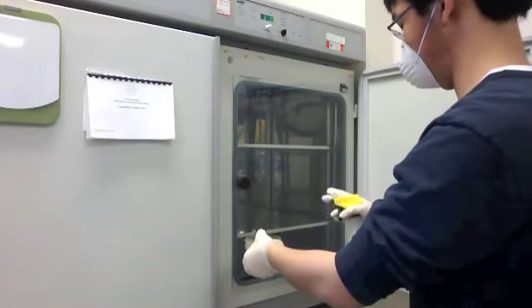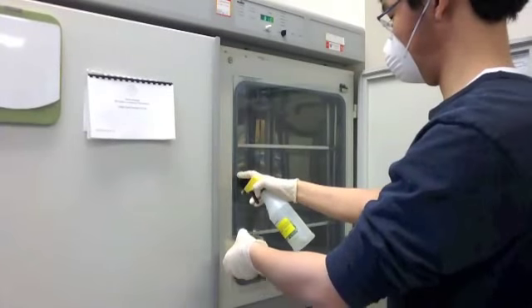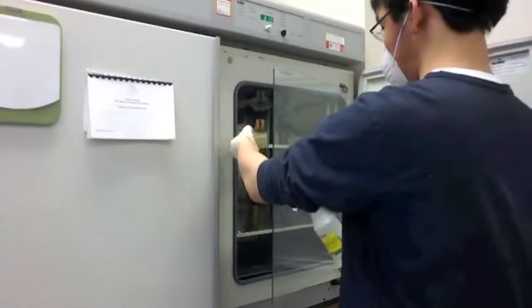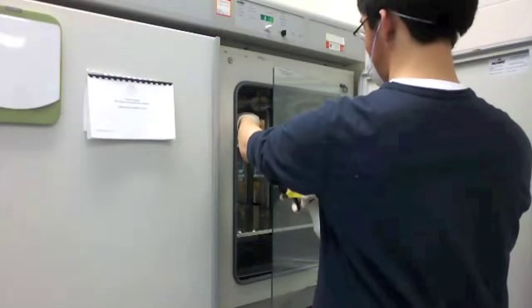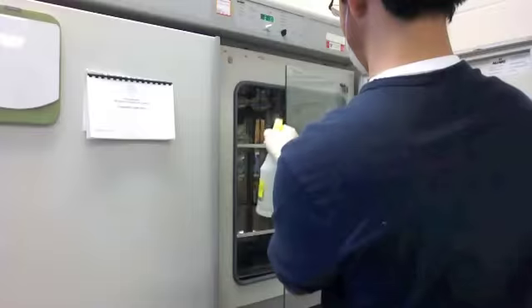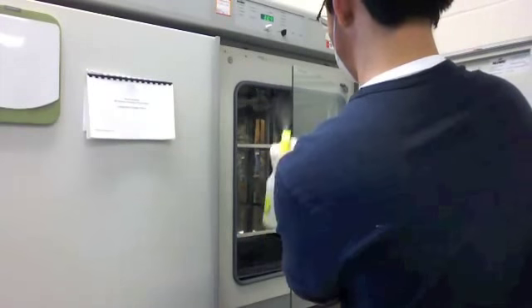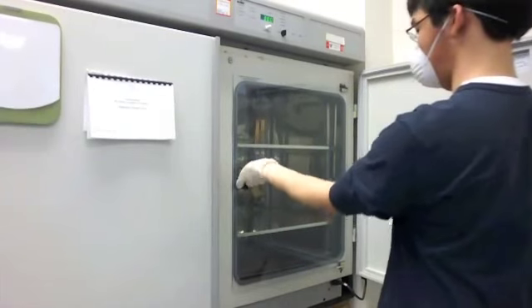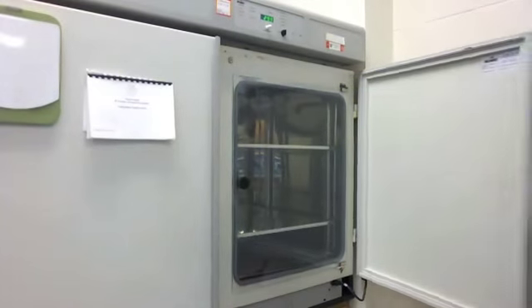I'm going to open the incubator just ever so slightly so I can put the petri dishes inside. Now I'm spraying the inside of the incubator with a lot of alcohol to make sure no bacteria is inside of it — as much as possible anyway. Then sealing it shut. And that's pretty much the procedure part.